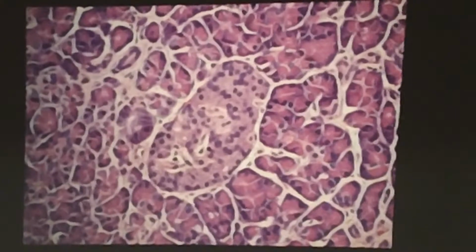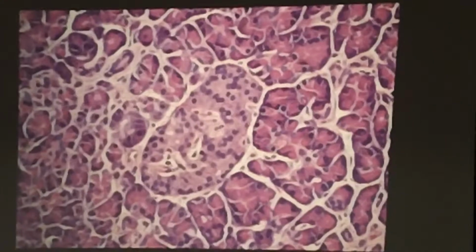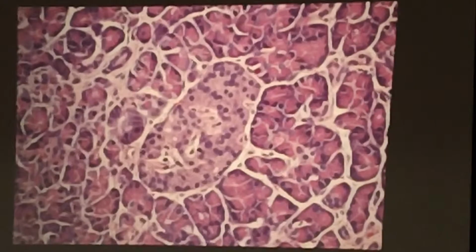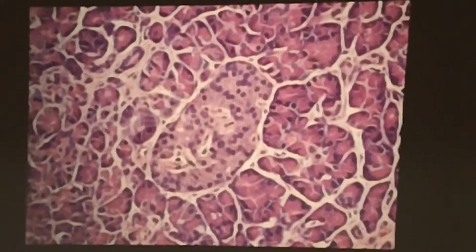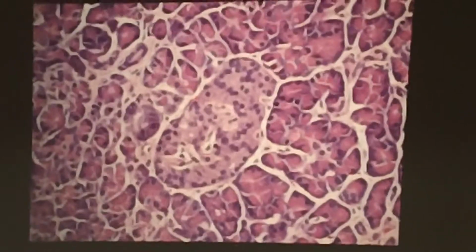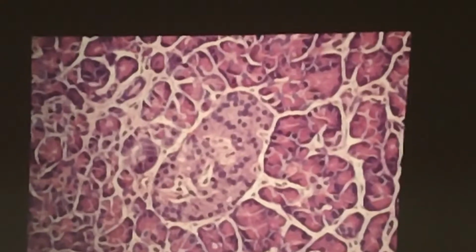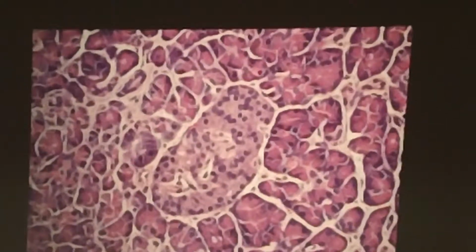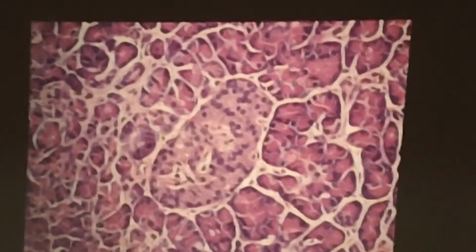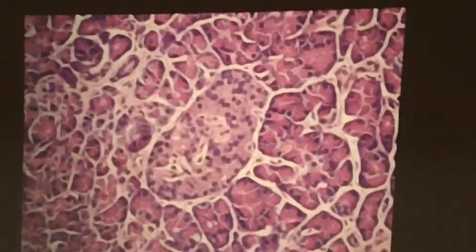If you look out here in this serous acini, in this region right here, you get that reddish or crimson color. If you were to look at this with high power, those would be the zymogen granules that contain what? Exocrine portion of the pancreas. All the pancreatic enzymes, the digestive enzymes. Okay, so that's red. It's basophilic because of a lot of rough ER, and you've got these red granules up in the apical region of the cells in the acinar.